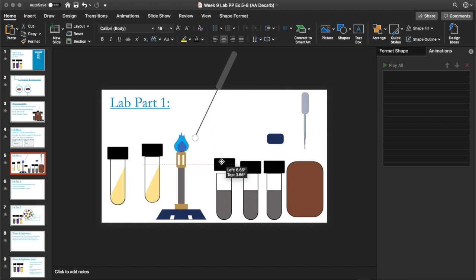Your lab manual says you want to create a layer that is around three to four millimeters thick. I don't think you'll have rulers to do that, but from my general experience, it takes around three to four drops at the most, depending on how big the drops were as you were transferring the mineral oil. Of course, it really doesn't take much, and you don't want to use more than what's necessary. The key thing to look for is that you have a uniform layer on top that will tell you that no oxygen will get through because the mineral oil layer acts as a cover or a seal.